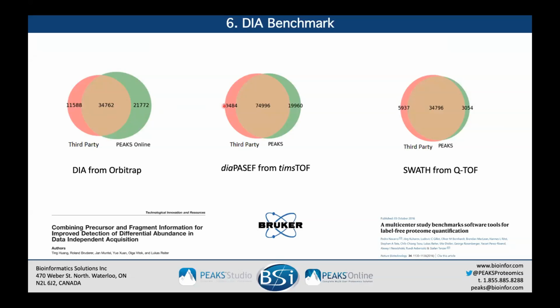But just as an overview, we do quite well against third-party software that we've tested, and majority of the peptides in different acquisitions, whether it be Orbitrap or timsTOF or SWATH and QTOF, are in the middle of the overlapping Venn diagrams.